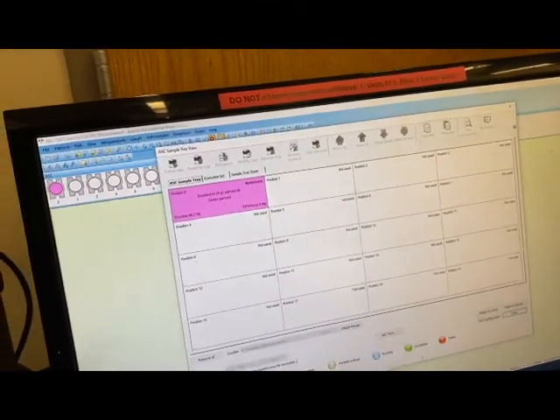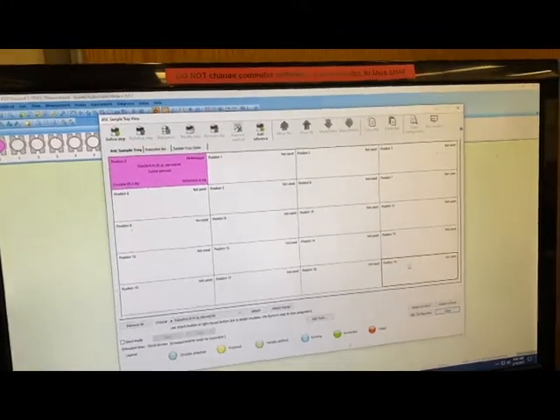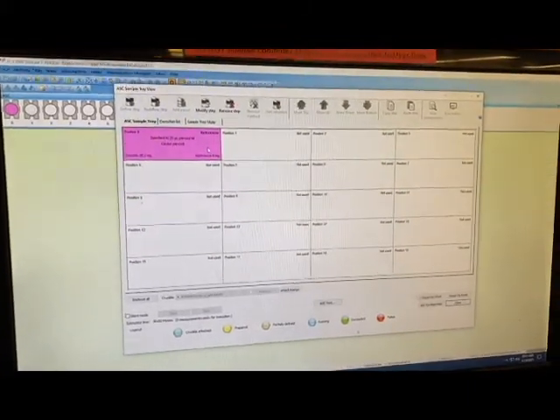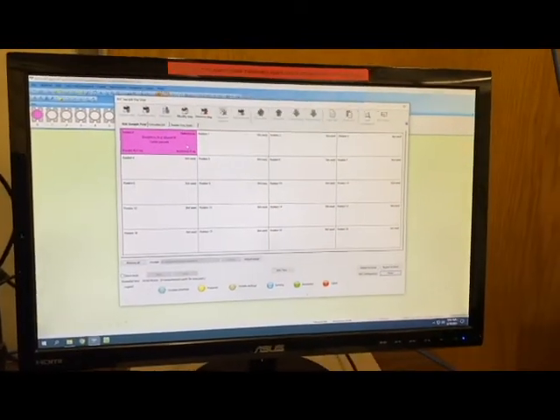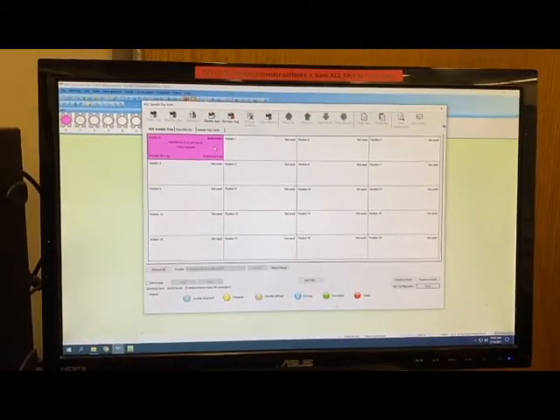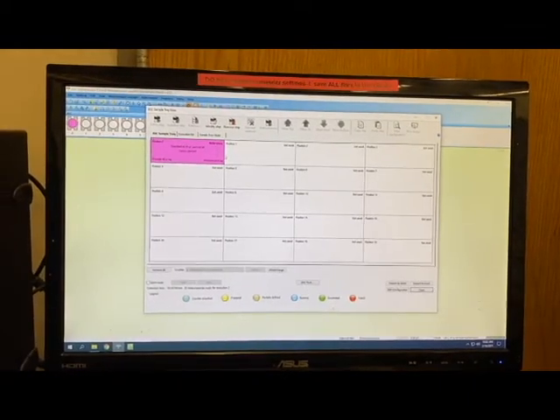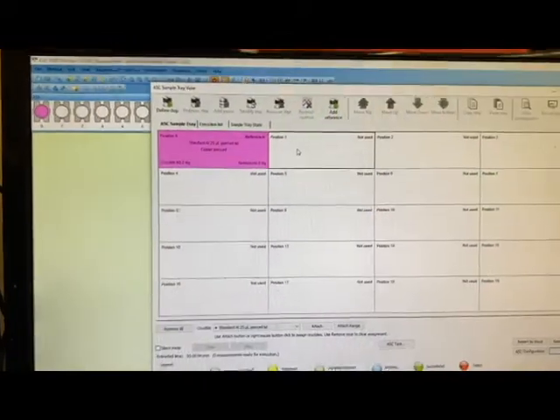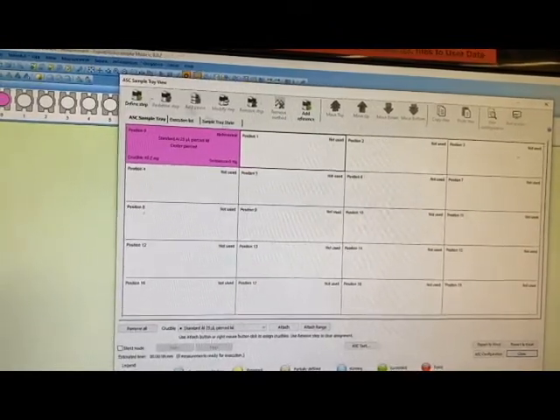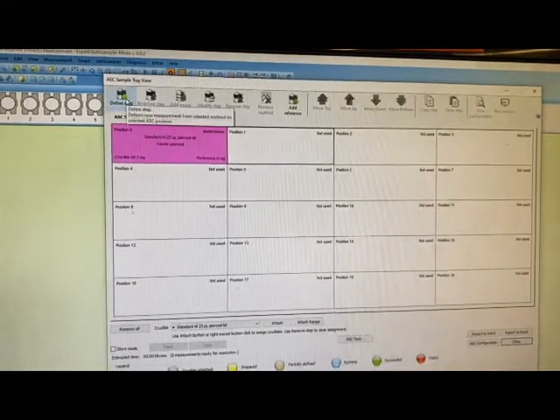This gives us a dialog box. It starts with position zero and goes all the way up to 19, mimicking the sample card that sits on the auto sampler. Position zero is always set up to be a reference — a center-pierced aluminum crucible that pretty much always sits on position zero. Position one is where you would typically put your correction or your empty crucible. Click on position one and click Define Step. If you want to add a secondary reference, you can click Add Reference.